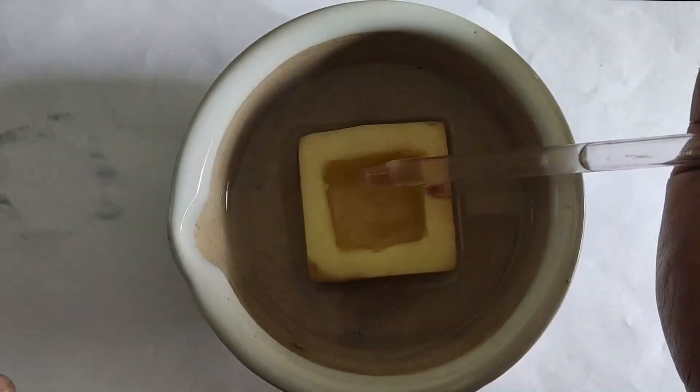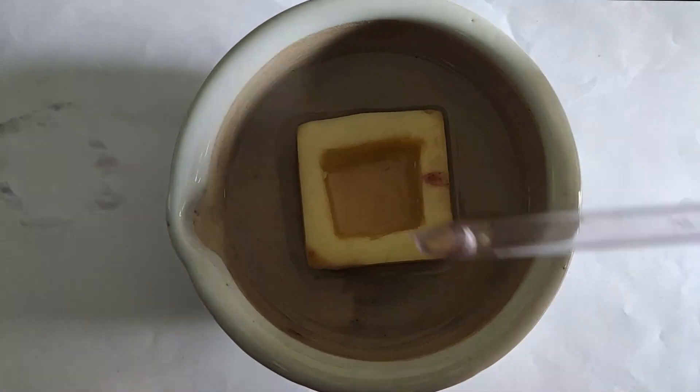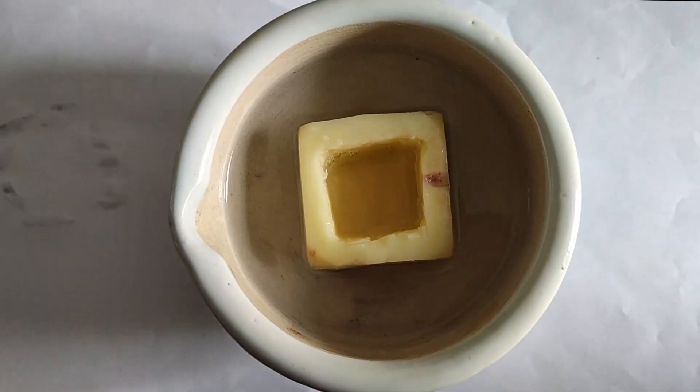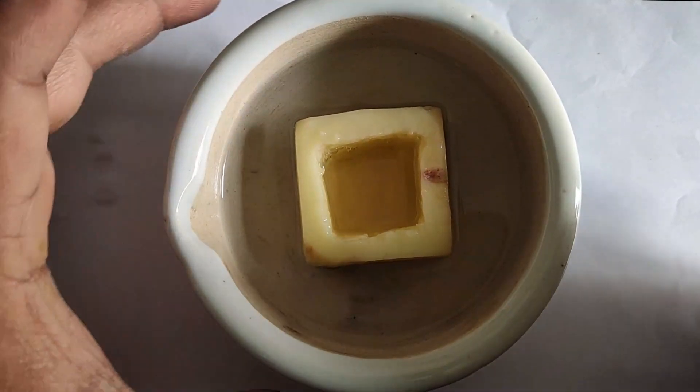Now I will pour this salt solution inside the hollow of the potato cavity and mark the level of the salt solution using a pin.